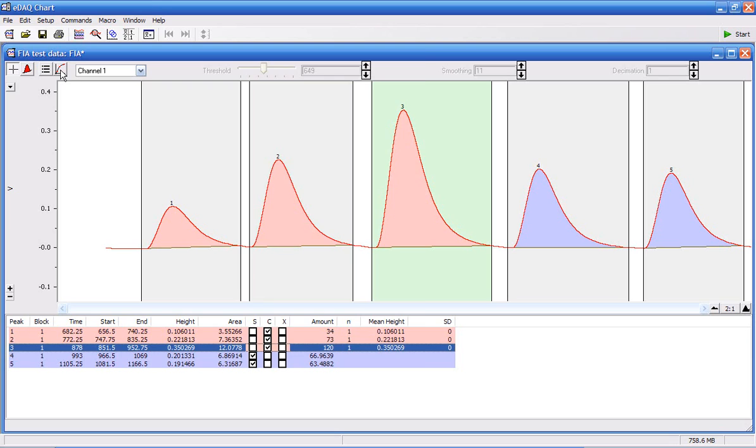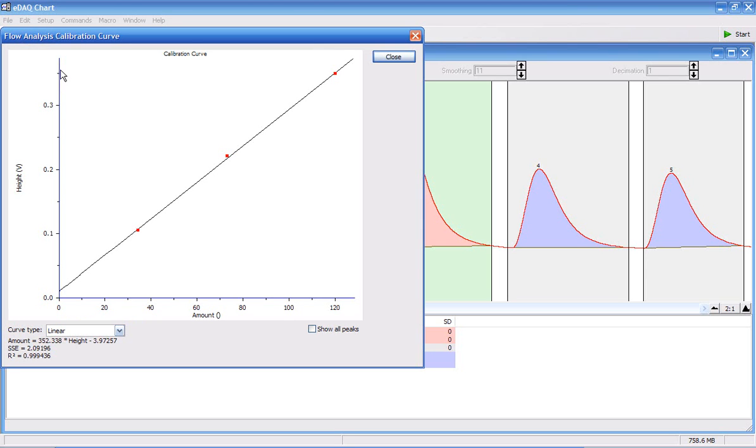If I go to here, it shows the calibration curve, showing my three calibration standards.